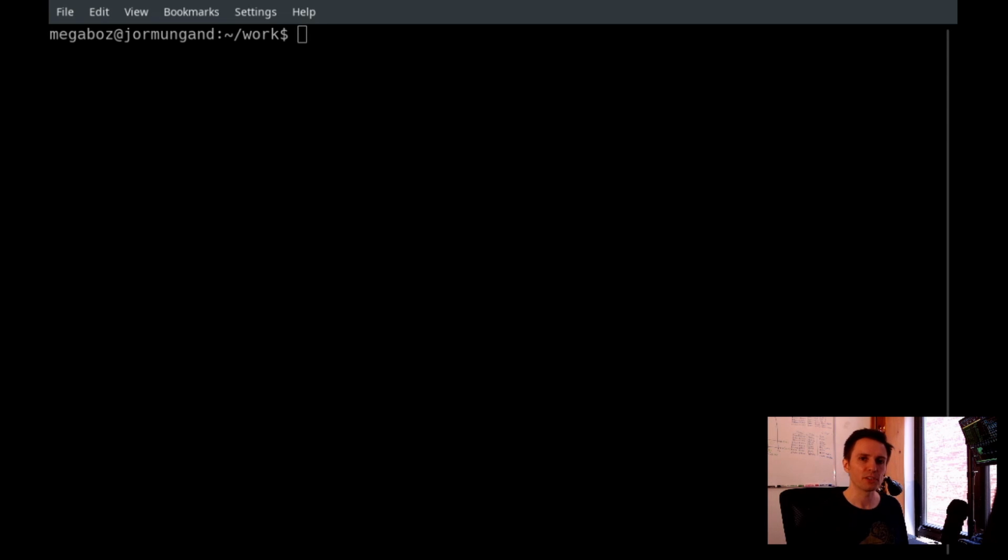Okay, so before we can start using Paladin, we will have to install it. Paladin is Linux and Mac compatible, so if you're running Windows, you're going to have to install a Linux virtual machine, or you can try using the Linux subsystem for Windows. I haven't tried it, but you might have luck with it.